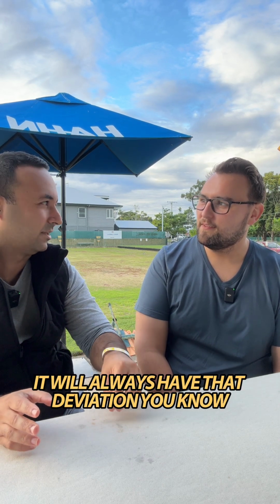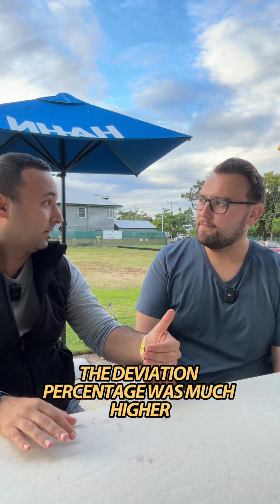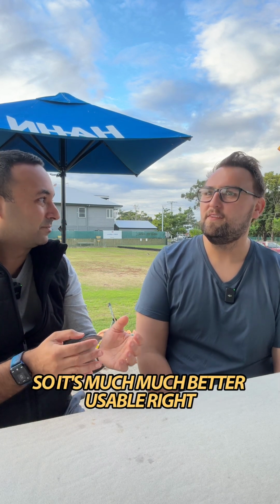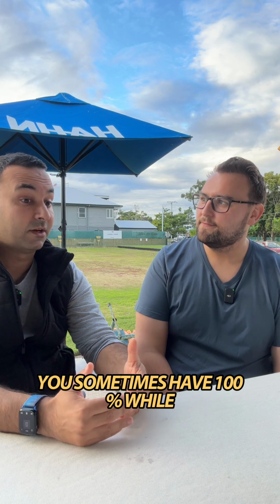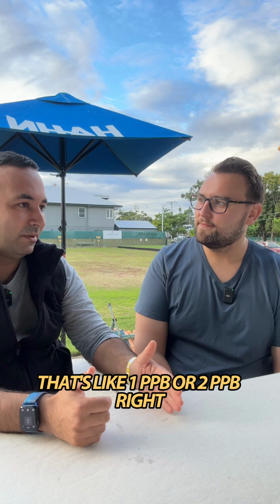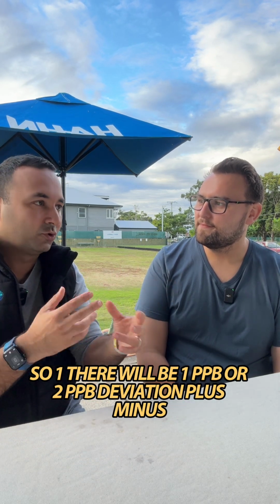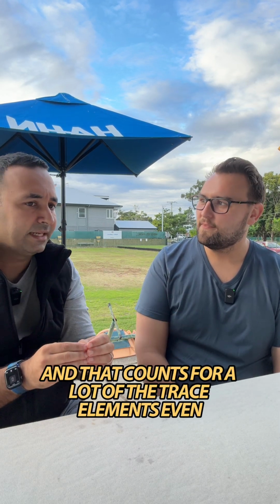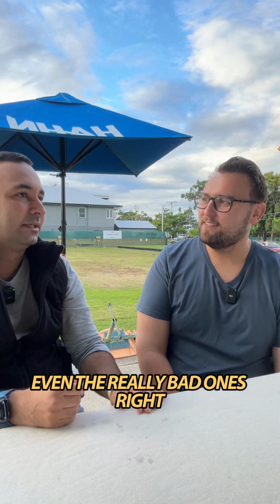It will always have that deviation. In trace elements, the deviation percentage-wise is much higher, but the real value, because it's a trace element, is much lower. So it's much better usable. When you look at phosphorus, for example, you sometimes have 100% deviation, while that's like 1 ppb or 2 ppb. So there will be 1 or 2 ppb deviation, plus minus, which is absolutely usable. That counts for a lot of the trace elements, even the really bad ones.